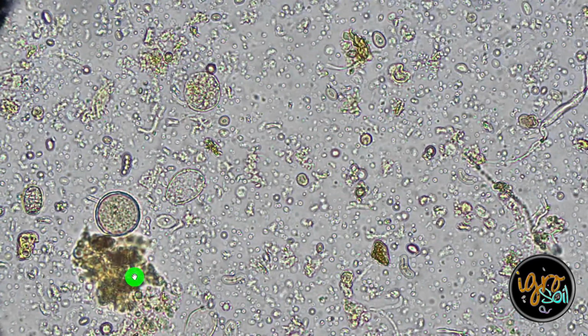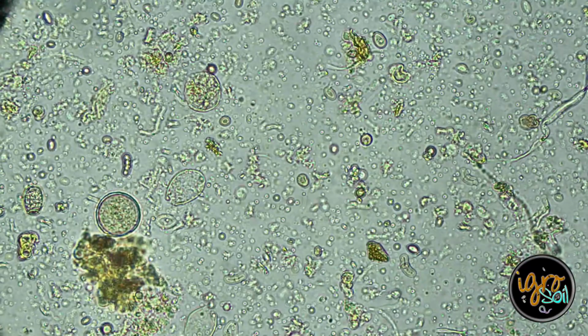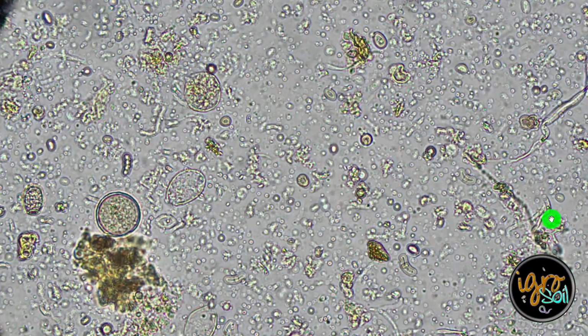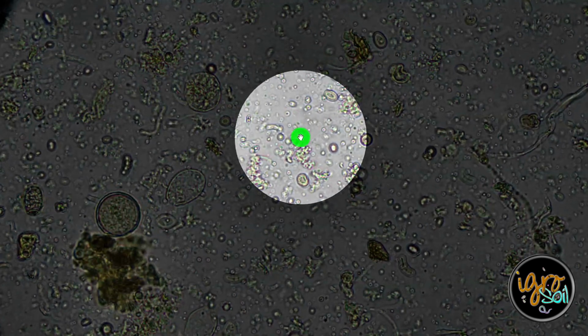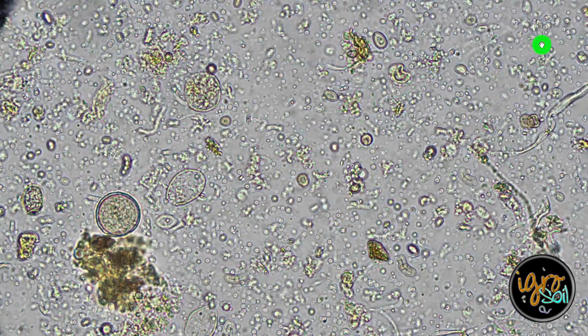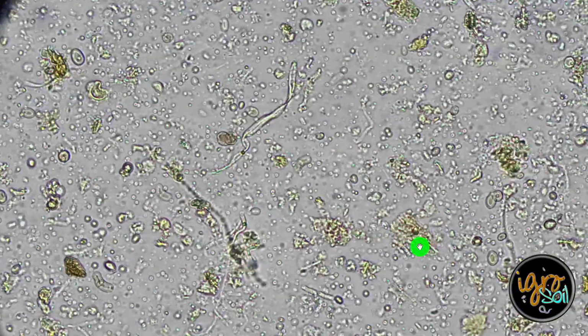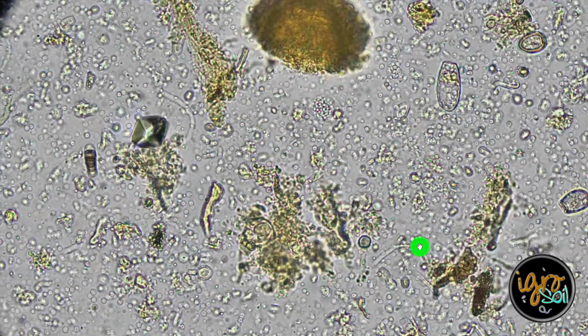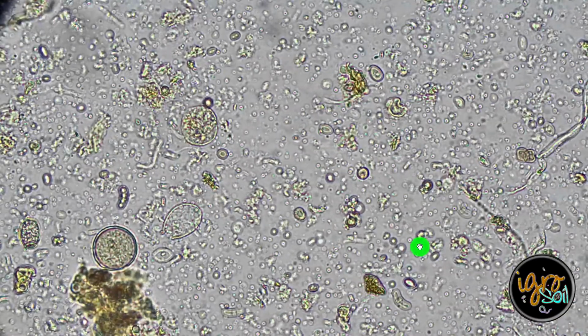Let me put the epi light on this stuff. Everything just kind of fades out. So, extremely active. And by the way, the bacteria, right? So we're looking at all these little things jittering in the background. You see that on the right side of the screen over here? Something big is moving over there. Let's find it. There's something large around here. Or something maybe swam past it or something.